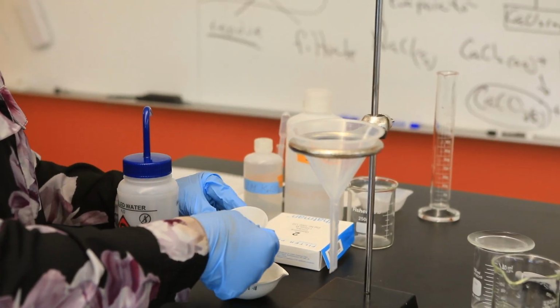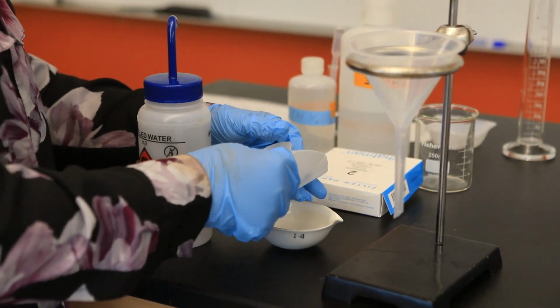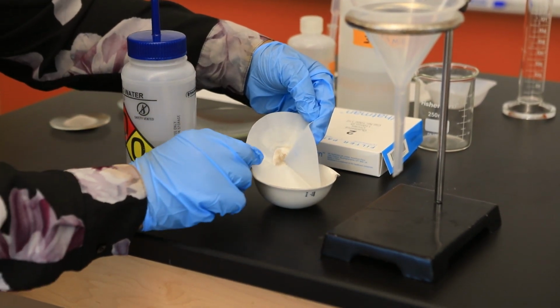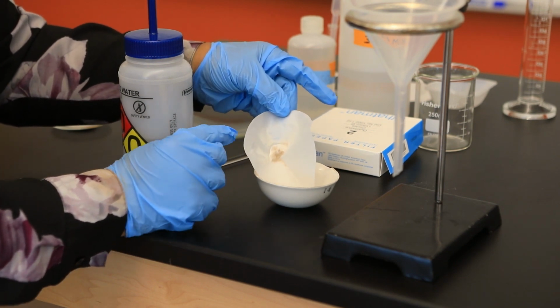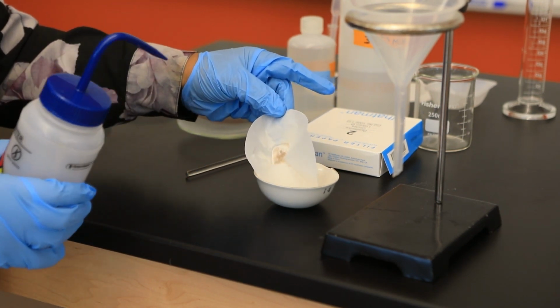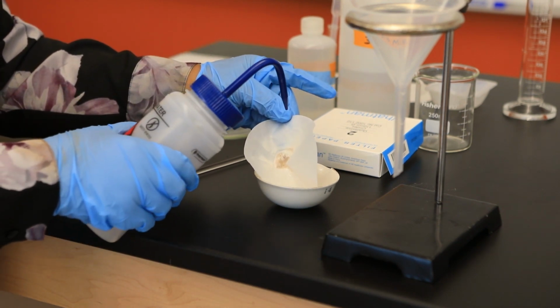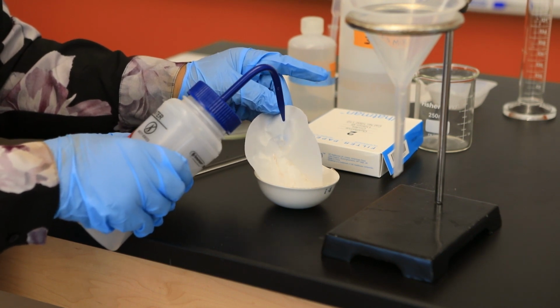I'm going to then open my fluted paper, and on that paper you should be able to observe our residue. The residue is just a mixture of our calcium carbonate along with sand. And with the aid of water, I'm going to transfer that residue to our evaporating dish.